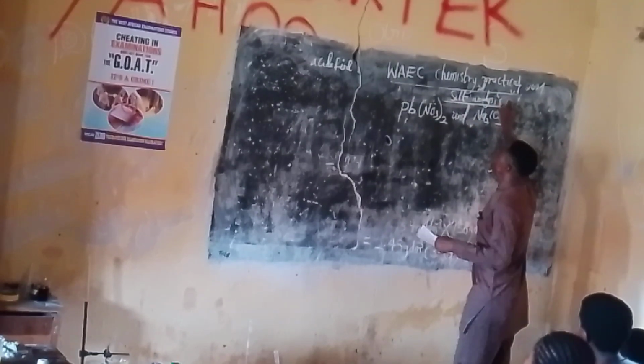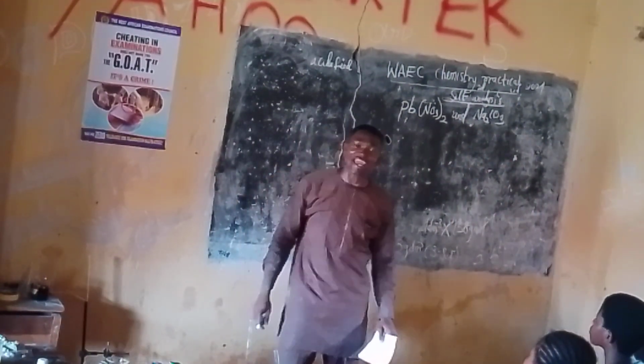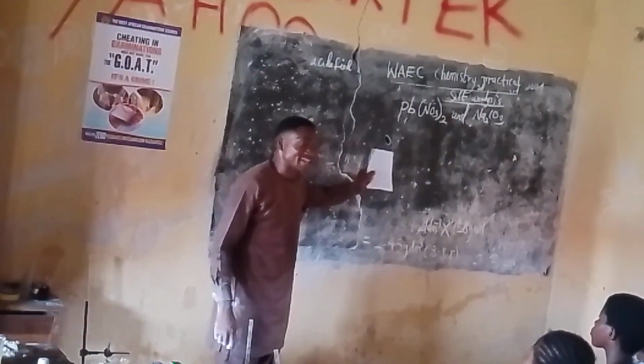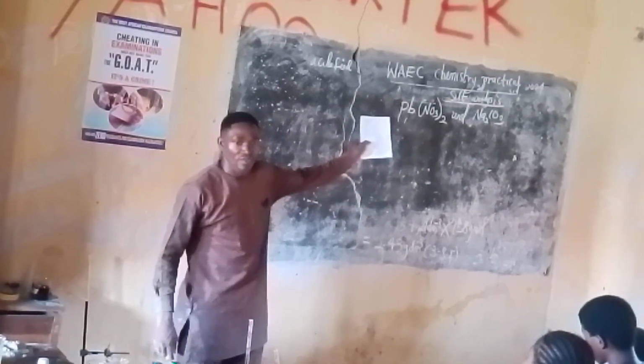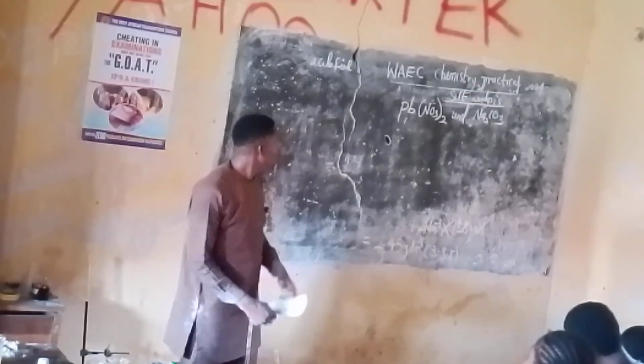In this salt analysis, you are expected to identify and confirm these relevant ions as the case may demand of you.